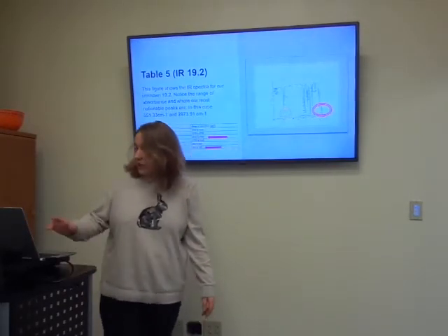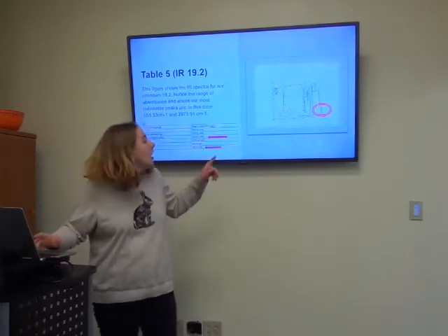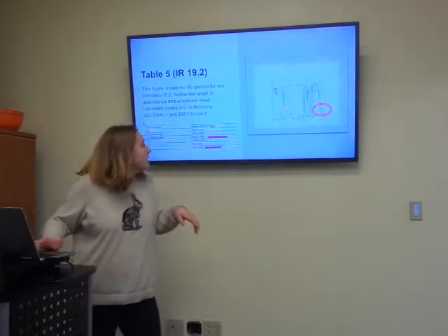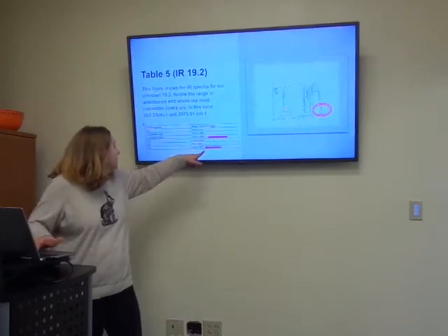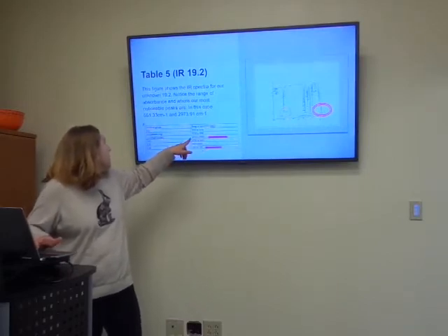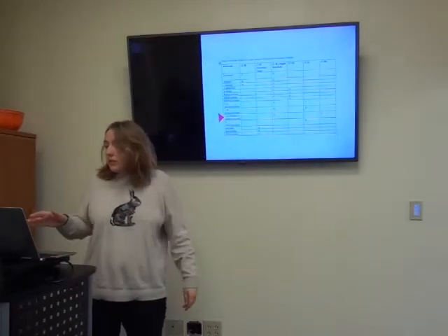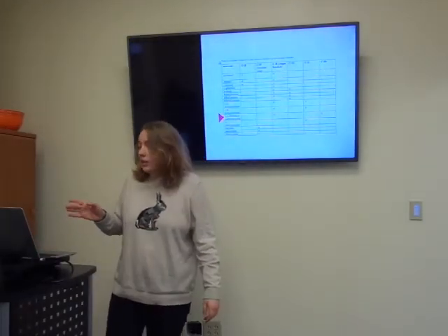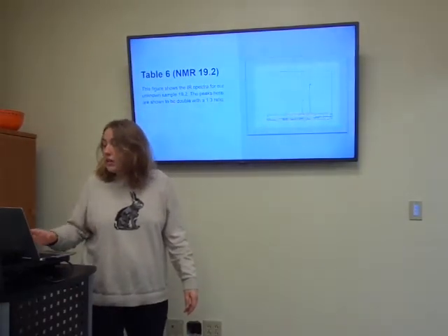And just to finish things up, we're looking at our last unknown substance, 19.2. Again, we're going to look at the deepest peaks, which show that we have a carbon to bromine functional group and another carbon to hydrogen single bonded functional group. And there's only really one of them that has a carbon to bromine functional group here, but again, we're just going to go ahead and look at the NMR spectra just to double check.